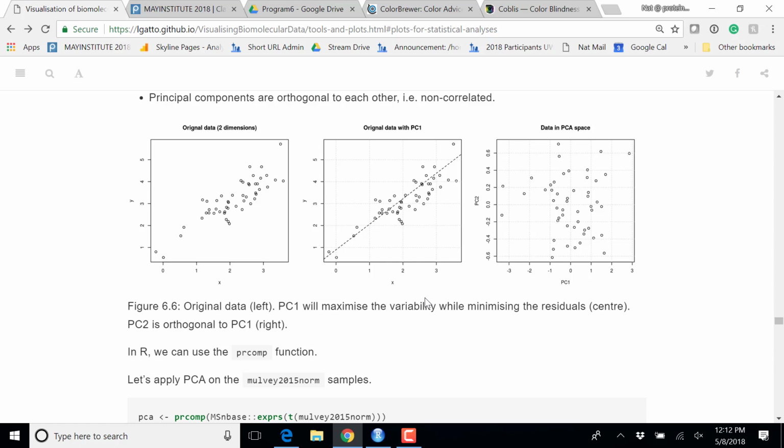In this case it's a 2-dimensional data set, but this generalizes to 3 dimensions or more, where the PCA algorithm is going to find a new dimension that maximizes this global variability. So this is an unsupervised algorithm. It doesn't look for any annotation. It doesn't care whether this separation is related to differential expression or any other type of annotation that we have. It looks at the global unsupervised variability to identify the first principal component, which is this new axis that maximizes variability.